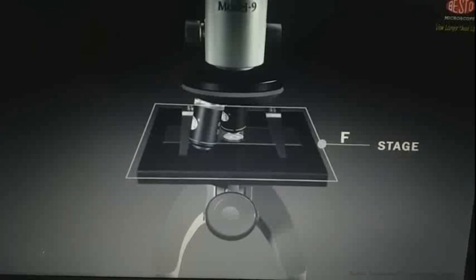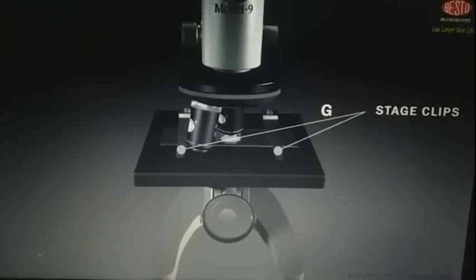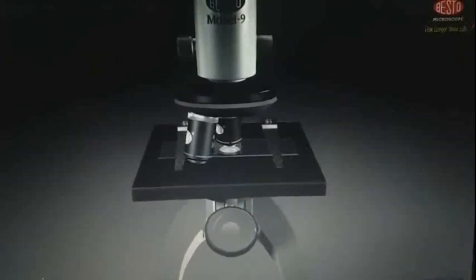F, stage. It is the flat surface on which you put slide or sample. G, stage clips. It holds the slides in place on the stage.